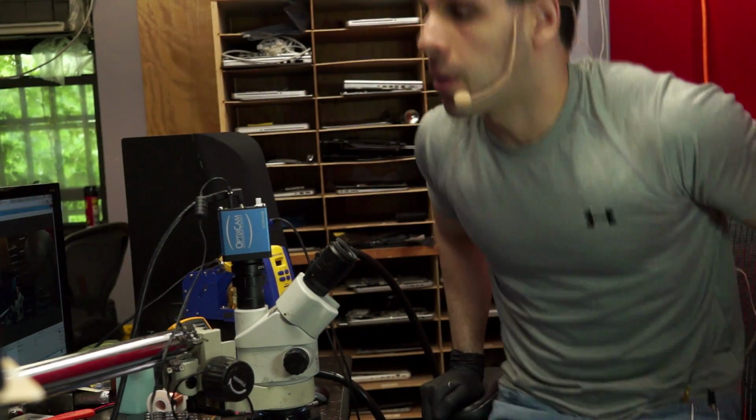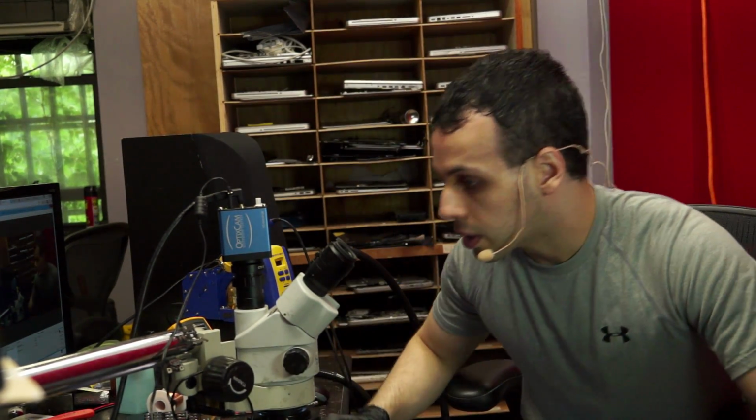So I'm going to be showing you a lot of what's going on with my microscopes over here. I have two of them, just to give you an idea of why I chose the microscopes I chose and what features about them make them interesting to me. The first thing about this microscope is that it is simulfocal. Simulfocal means that you can see out of both eyepieces while using the camera. So if you look at my microscope over here, you can see that I have this little camera attachment on it, right? So I have the camera, but then I'm looking through here.